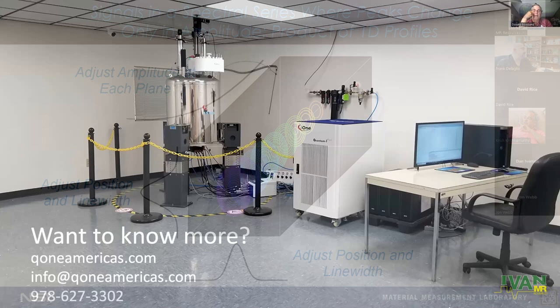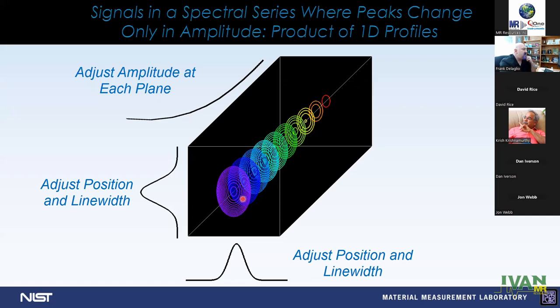So for example, let's consider a 2D relaxation series. And in a series like this one, we have a collection of peaks over a set of planes. And each peak stays in the same place, but its intensity changes over the course of the planes. So this pseudo 3D data can now be described as the product of three different profiles: a line shape profile for the directly detected dimension, a different line shape profile for the indirect dimension, and an intensity evolution profile in the pseudo 3D dimension.